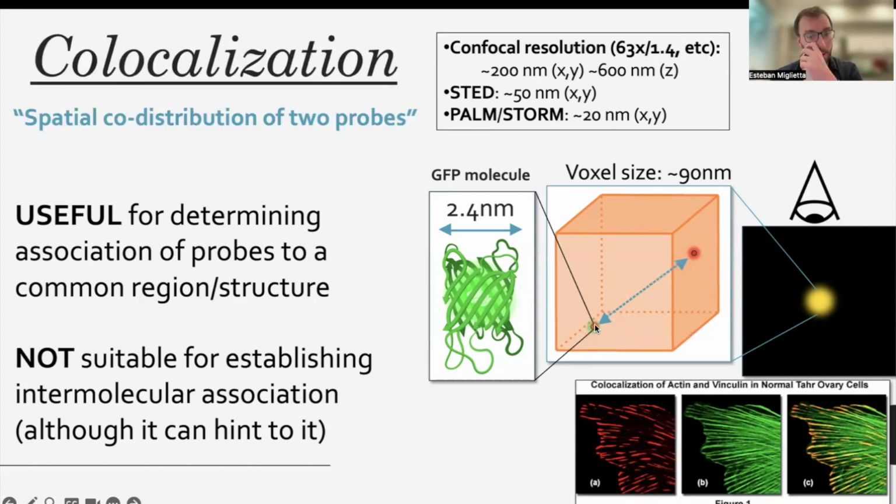This is why one has to be very careful when interpreting colocalization as saying that these two molecules are touching or interacting with each other. It's a very good preliminary result to hint at something like that, but you will need further, probably biochemical, assays to actually prove that such an interaction exists.